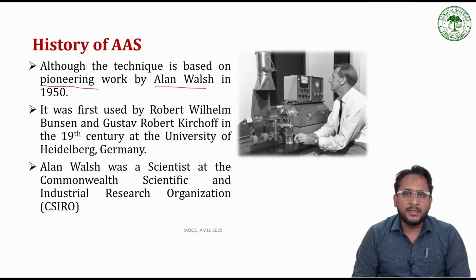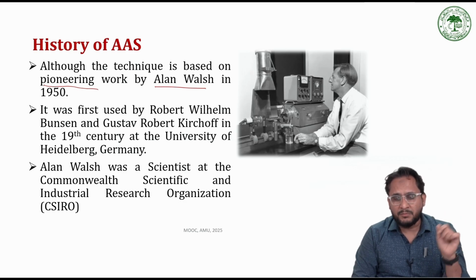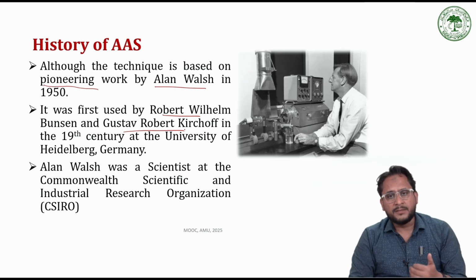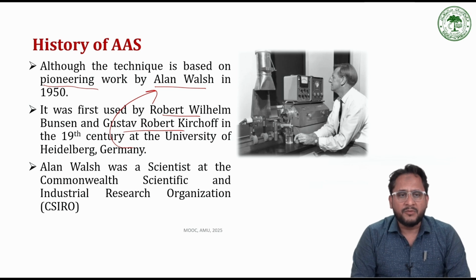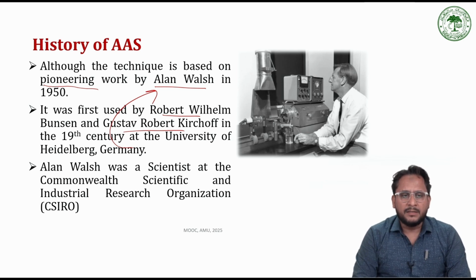G.R. Kirchhoff is the scientist who theorized and proved that each and every pure component has its own characteristic spectrum. So they together worked on this technology and developed atomic absorption spectroscopy. But the instrument is based on the work of Professor Alan Walsh. He was a scientist at the Commonwealth Scientific and Industrial Research Organization, CSIRO.